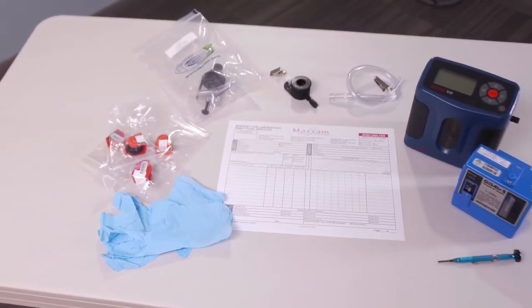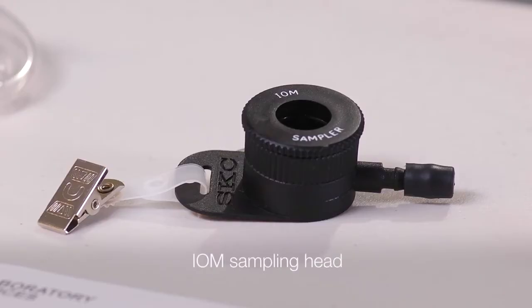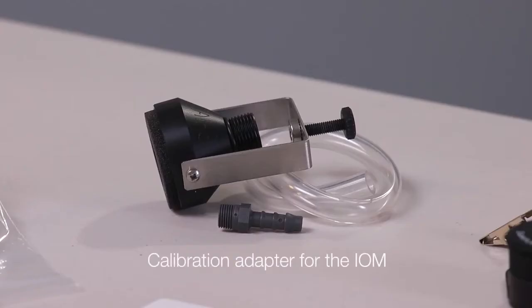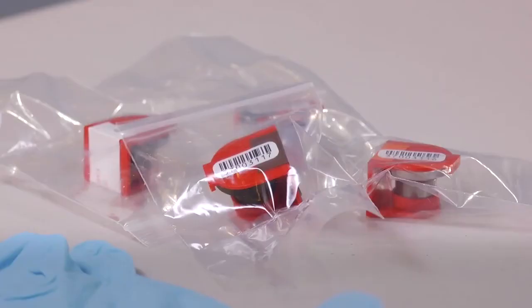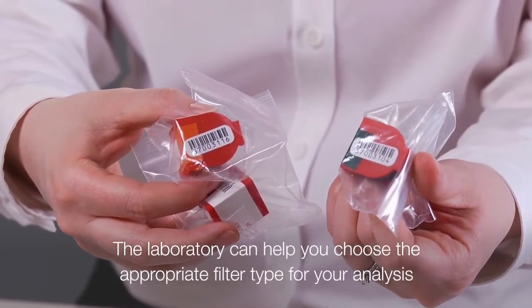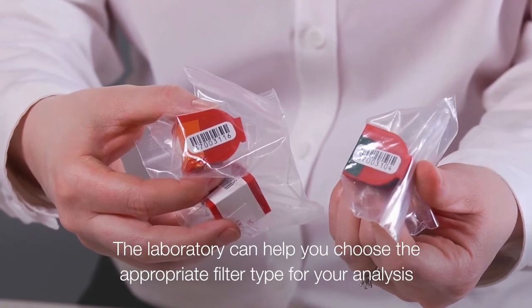This video will demonstrate how to collect air samples for inhalable dust using inhalable or IOM samplers. You will need IOM sampling head, a calibration adapter for the IOM, sampling cassettes and transport clips. The laboratory can help you choose the appropriate filter type for your analysis.